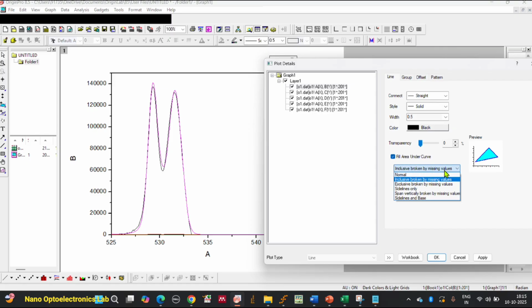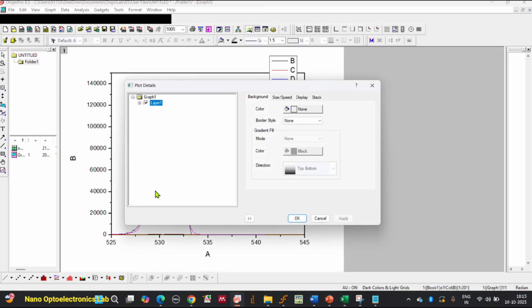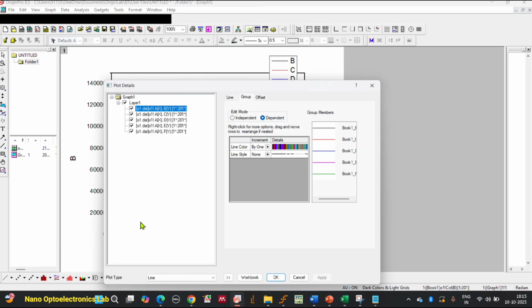I'm just going to give normal, and the transparency is up to you. You can give any color you want.